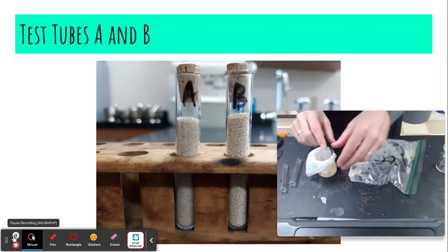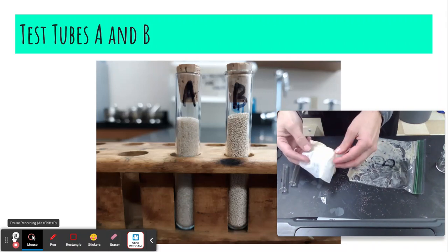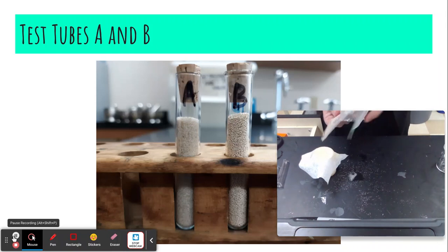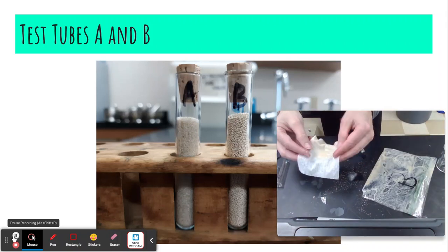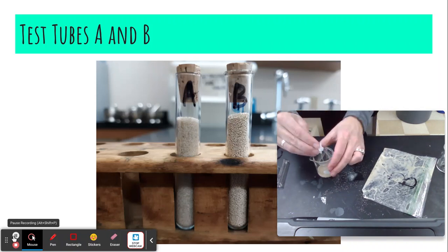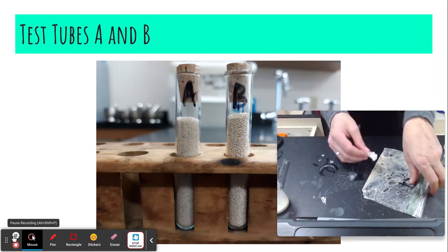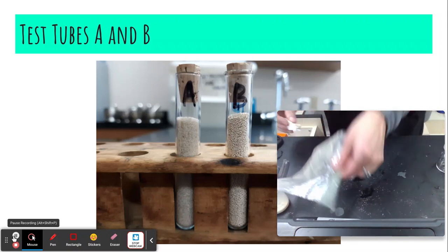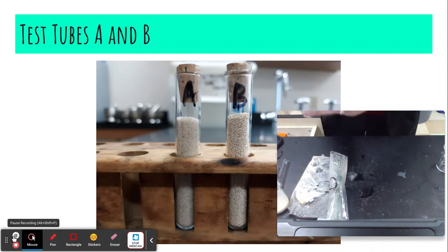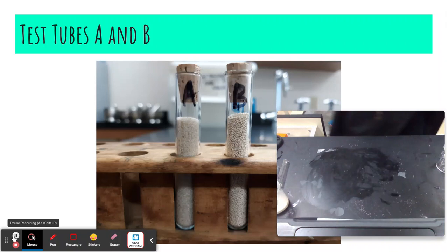And it's making a nice filter for me, filtering out all the solids. Kind of hard to do by myself, but I think we've got enough. So now I'm just going to squeeze it, get that last little bit in there, and I'll show it to you. That's our liquid that we've got. So there might be DNA in there, and that was baggie B. I'm going to keep that set aside, get it out of our mess. It makes such a mess here, so I'll get this out of our way.